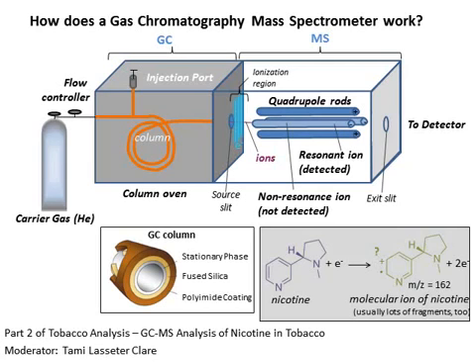So the type of mass spectrometer is a quadrupole mass spectrometer, which is a very common type of mass spec to use. And before the entrance of the quadrupole, there is a filament across which a large current runs that causes electrons to boil off. Molecules within the GC collide with the electron beam within this zone, which is called the ionization region. And when molecules and the high energy electron beam collide, another electron may be knocked off from the molecule, making the original molecule into a cation that would have the same mass as the original molecule.